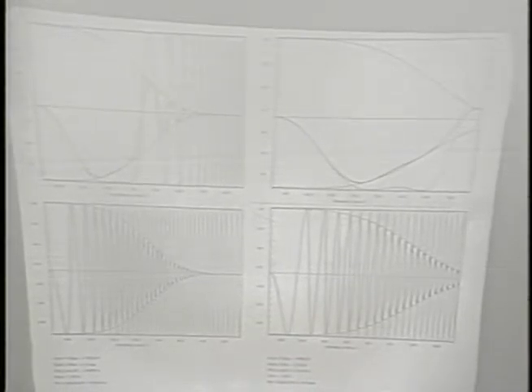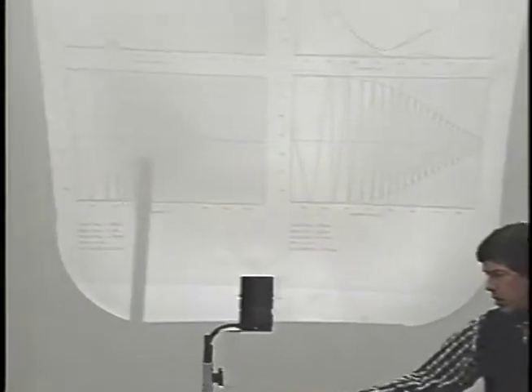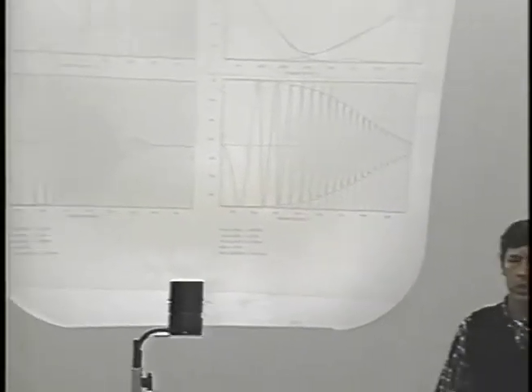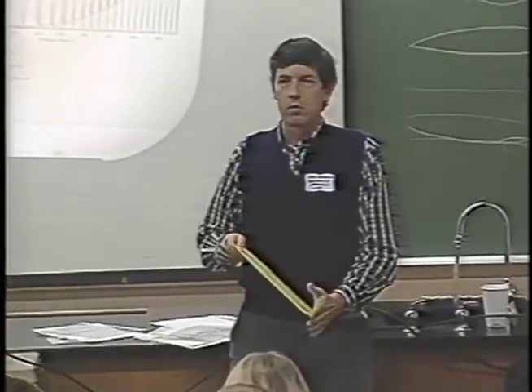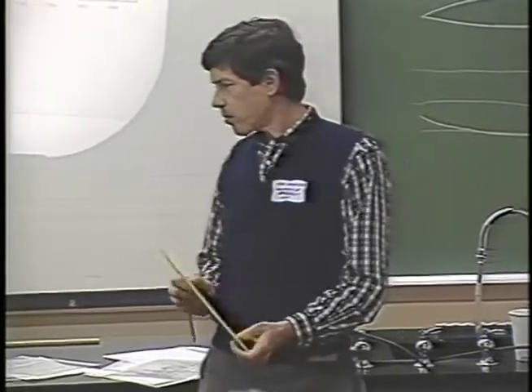that becomes computationally quite difficult, and under many circumstances it means that the resolution will be not nearly as good in practice at the two ends of the film. So with the increase in depth of focus with the high voltage microscope, essentially we'll be able to use a much wider range of the film that's reasonably close to focus.